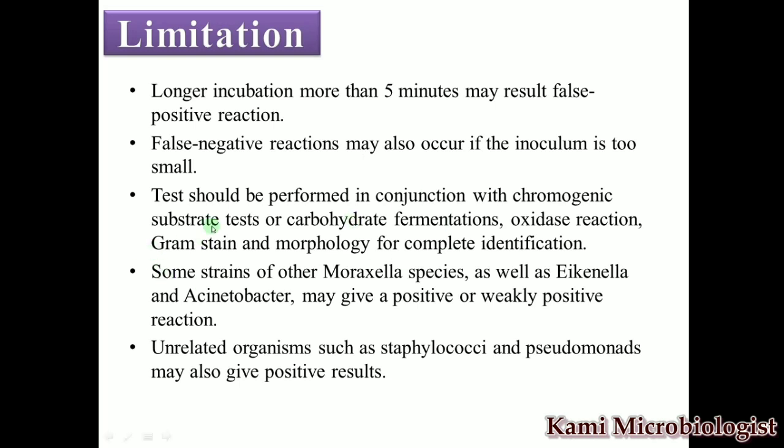Next point says that this test should be performed in addition to other tests, like carbohydrate fermentation, oxidase reaction, gram staining, and morphology. All these tests are also performed for complete identification.